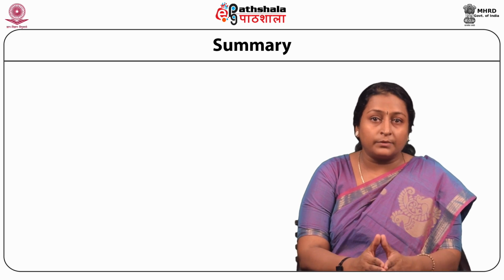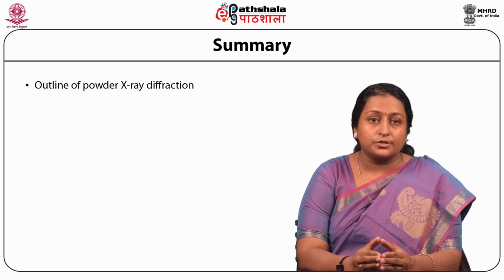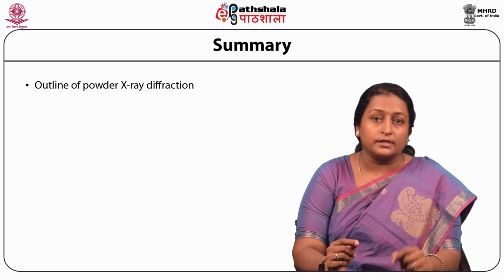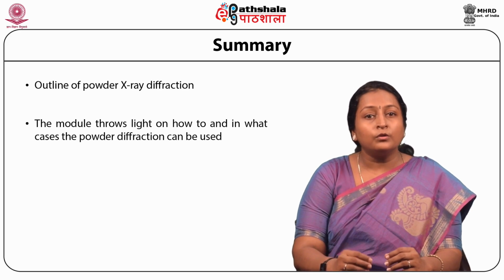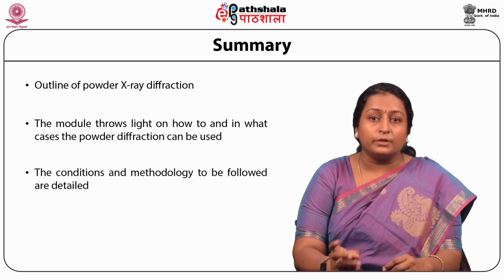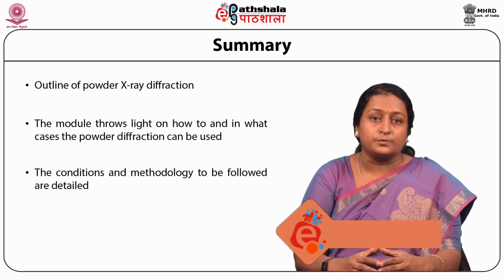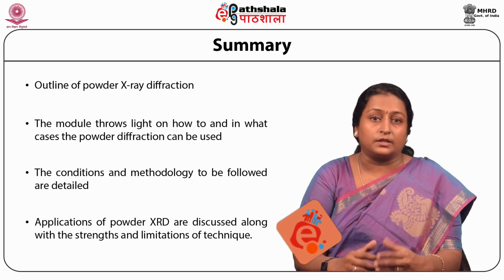So students, let us summarize what we have learnt in this module. The module deals with the introduction of powder X-ray diffraction, which is one of the most widely used analytical methods to study various properties of materials. The module also throws light on how and in what cases powder diffraction can be used. The conditions and methodologies to be followed in X-ray powder diffraction are detailed in this module. The applications of powder XRD are discussed along with the strengths and the limitations of this technique.